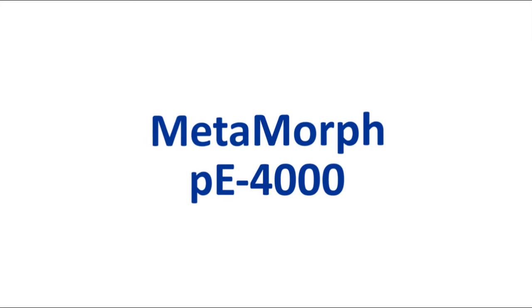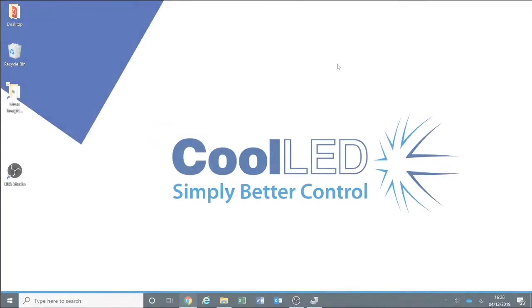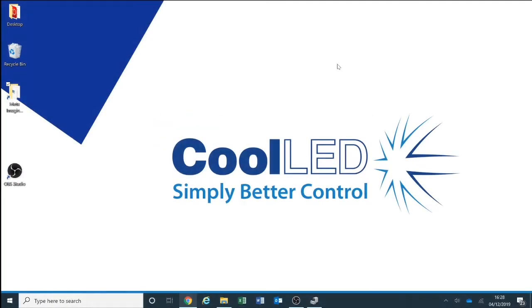Welcome to the CoolLED tutorial video for MetaMorph. In this video, we'll be showing you how to set up the pE-4000 in MetaMorph imaging software.